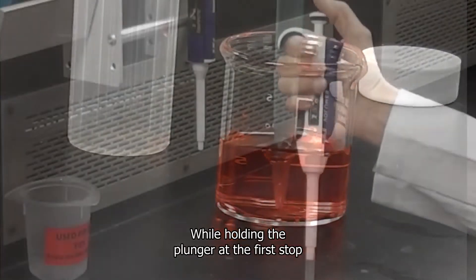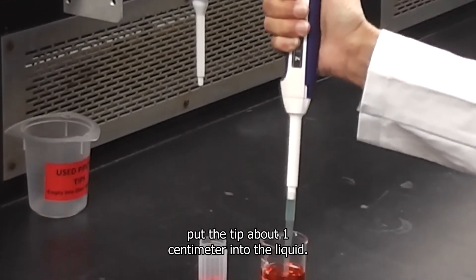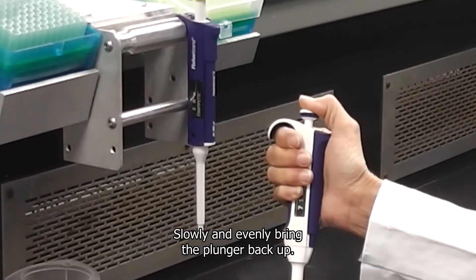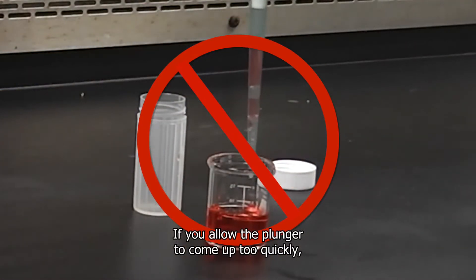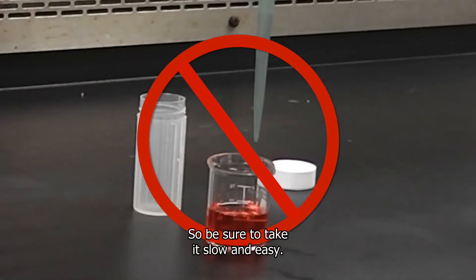While holding the plunger at the first stop, put the tip about one centimeter into the liquid. Slowly and evenly bring the plunger back up. If you allow the plunger to come up too quickly you can get air into the tip, so be sure to take it slow and easy.